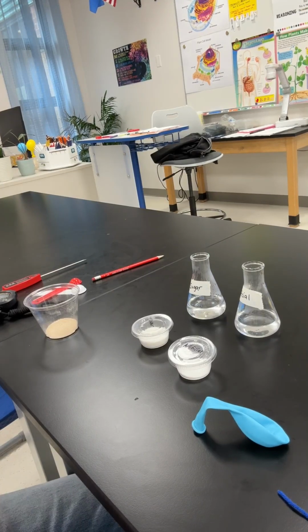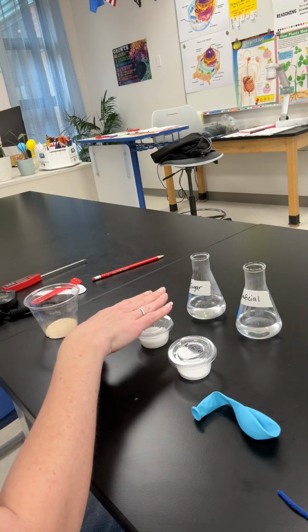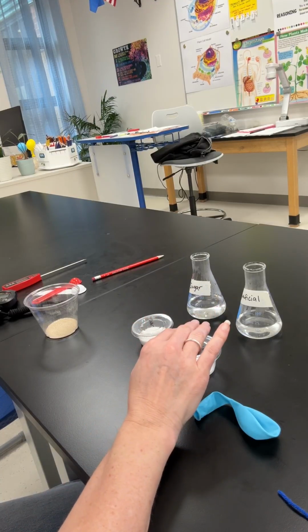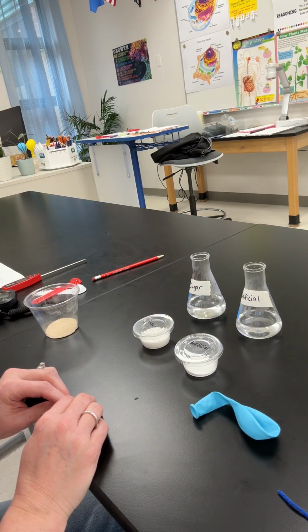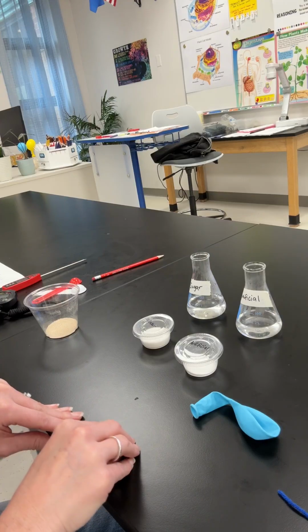Today we are going to try to figure out how different sweeteners affect the rate of cellular respiration. I've got two different kinds of sweeteners. I've got sugar, which is a natural sweetener, and then I've got an artificial sweetener. We're actually using sucralose. For our bodies, when we go through cellular respiration, we release carbon dioxide and water. Those are the outputs.